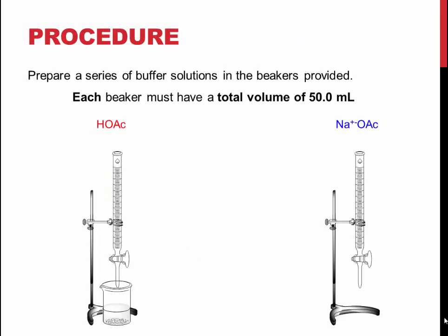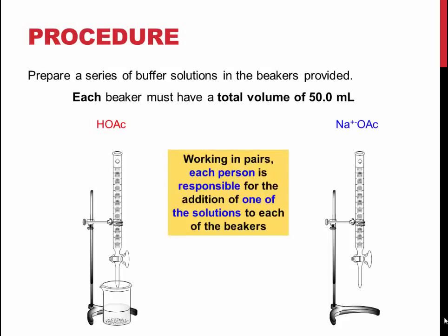Several buffer solutions need to be prepared using very precise volumes. Follow the table in your lab manual to add the correct amount of each solution, and use a burette to deliver the correct volume of each solution. The final volume of each solution needs to be exactly 50 ml. You and your partner should each be responsible for the addition of one of the solutions to the beaker using two separate burettes.